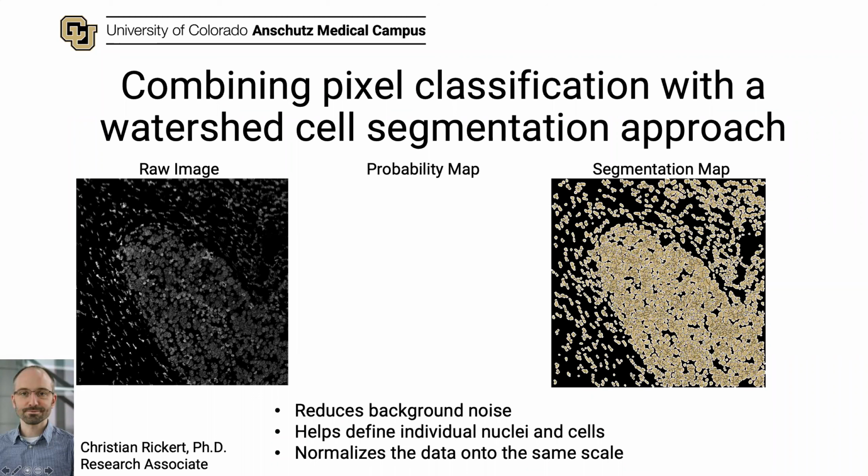what we're doing is running the pixel classifier ahead of a watershed algorithm to do the cell segmentation. Here you see this pixelated anti-double strand DNA signal. The probability map that's supposed to be there is really nice and smooth and really normalizes the signal. You'll actually see that on another slide, I have another example of this probability map. And then the segmentation uses the probability map rather than the raw image data to develop the watershed algorithm to actually generate the nuclear and cytoplasmic and membrane masks that go over the image.